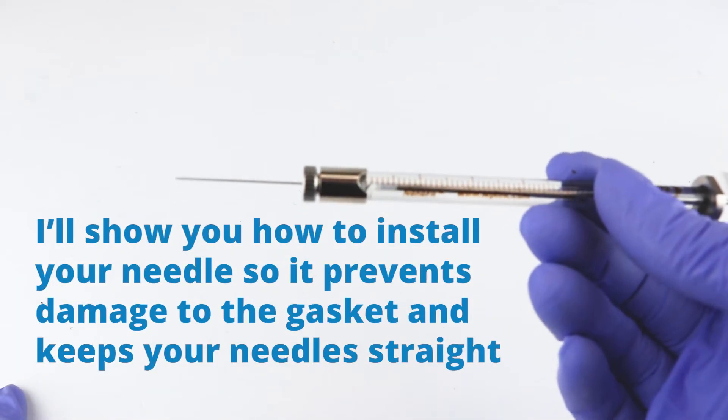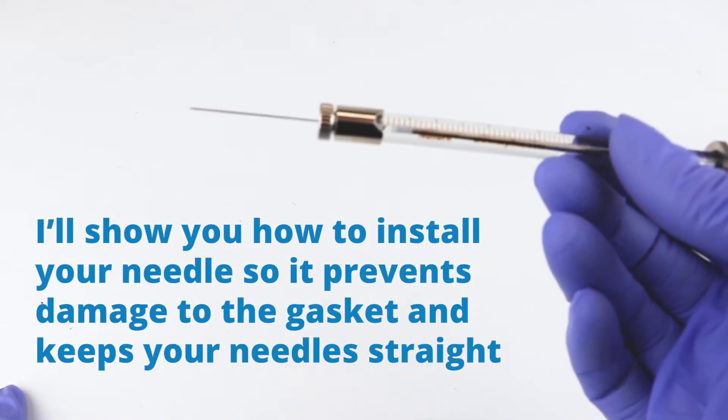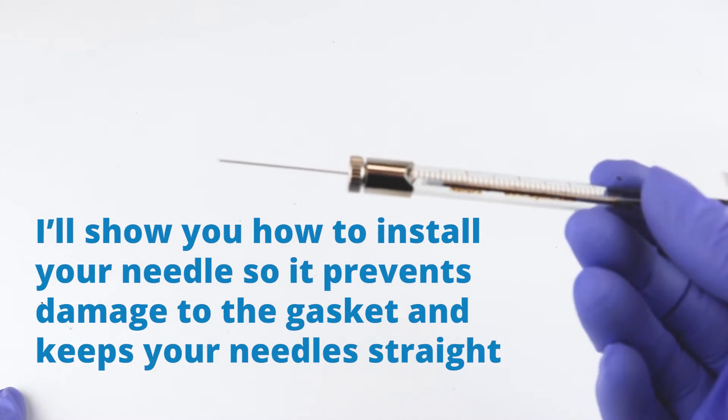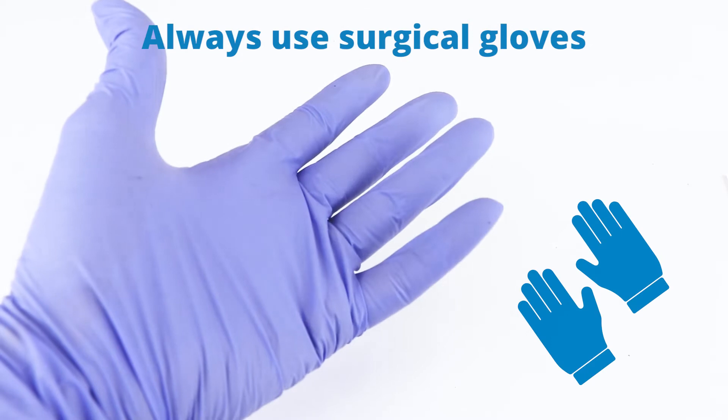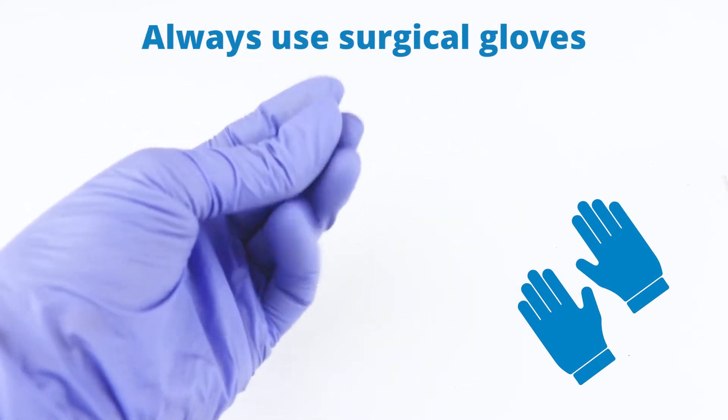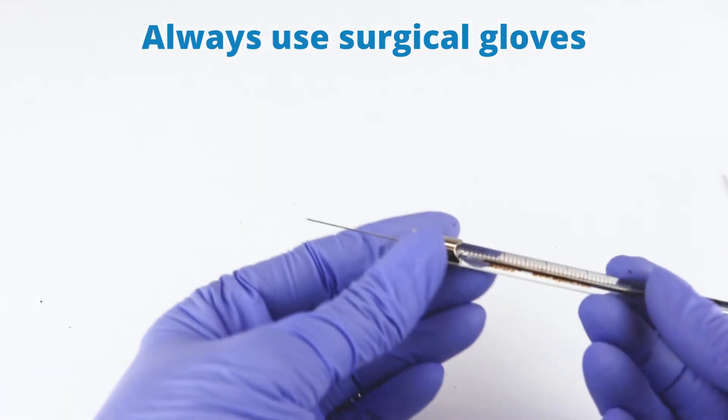I'm going to show you how to install your needle so you prevent damage to the gasket and keep your needle straight. Always wear surgical gloves when you're handling it to keep your skin oils off the needle and the components.